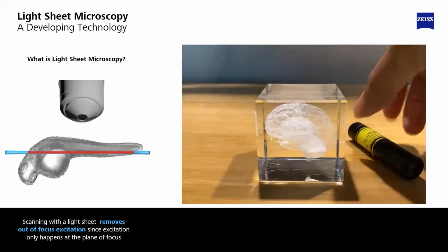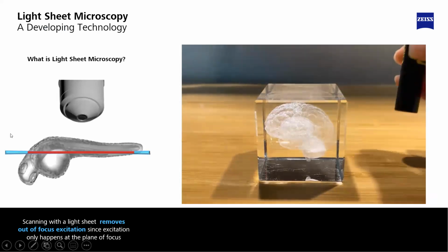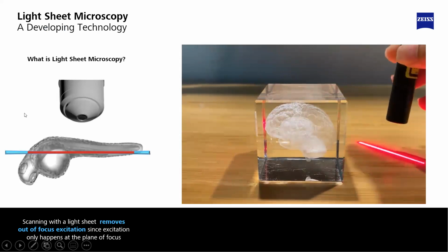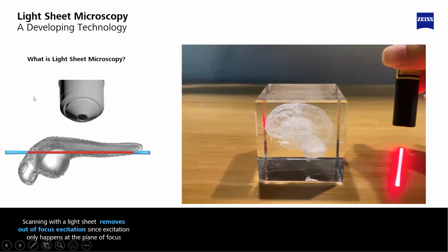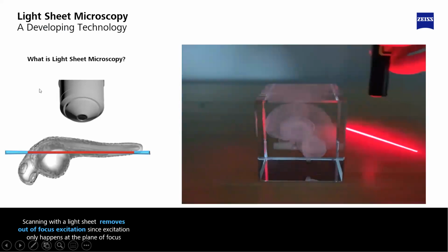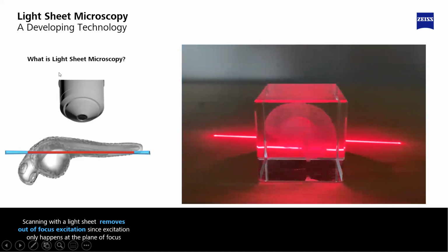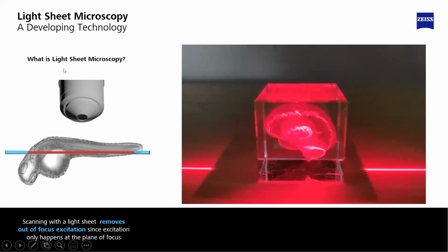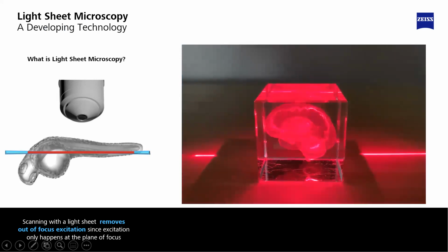So let's talk a little bit about how lattice light sheet imaging actually works. To understand the principle, I just want to forget about the term lattice for a minute and focus on light sheet. Some of you, or maybe all of you even, have some experience with light sheet microscopy, either with the Zeiss Light Sheet Z1 that's present on campus, or maybe you've had access to one elsewhere.